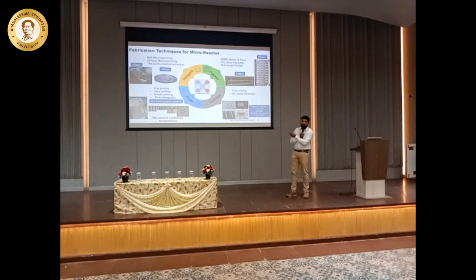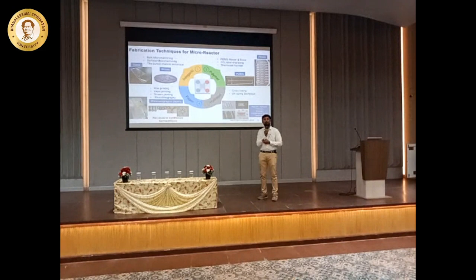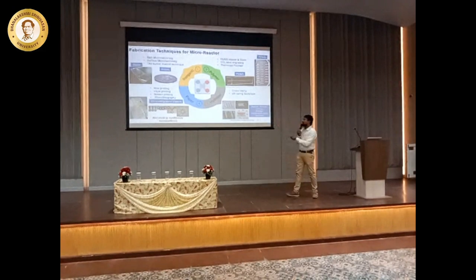I don't need a clean room here. I just need very few instruments, which can bring it to a price of, say, one device for 200 rupees or 100 rupees, depending on what it is. So these are all the ways. Since we are not much exposed to silicon-based work and don't have many facilities here, we are trying to bring out what can be done in my lab itself. So we are developing these polymeric, PMMA-based microfluidic devices that can provide beautiful structures, whatever designs you want, and we can create your nanostructures.